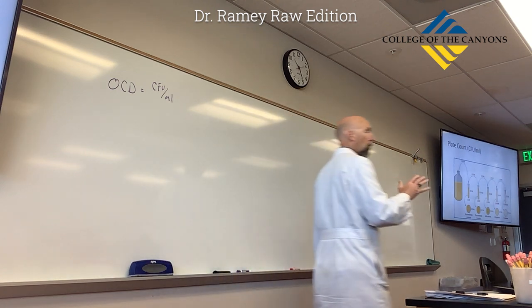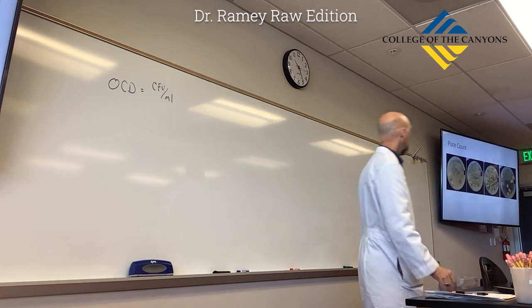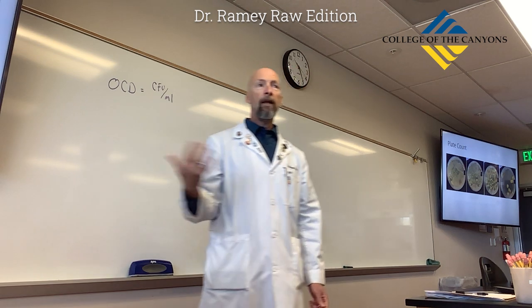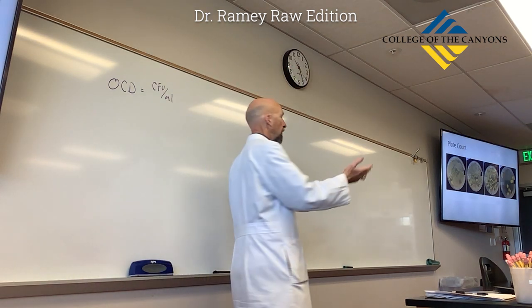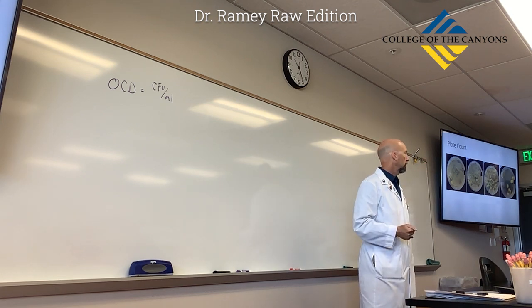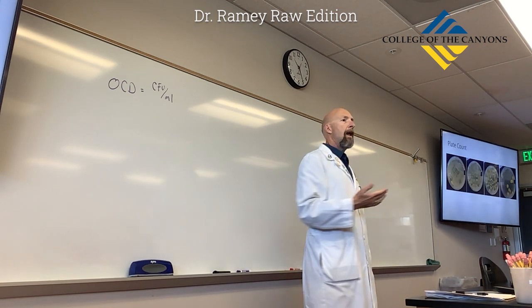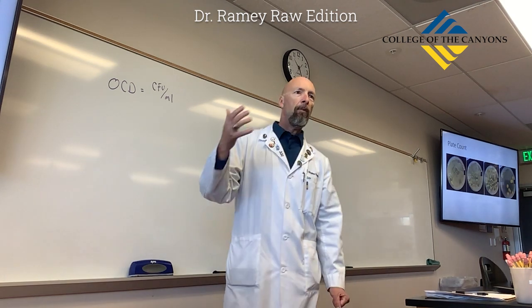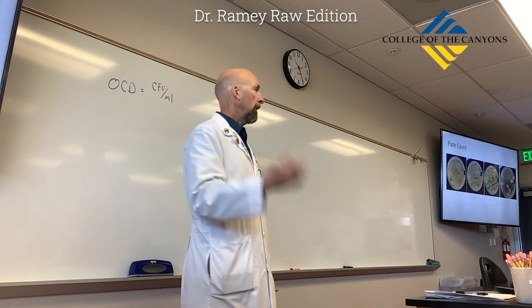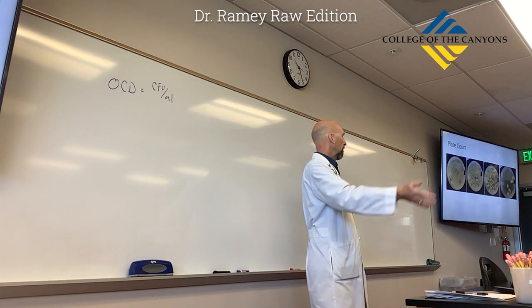And if you do that correctly, you're going to end up with 4 plates on Tuesday. You're going to inoculate 4 plates today. If you do it correctly, your plates are going to look something like this. You can see, from left to right, plates A, B, C, and D. Those are going to be your 4 plates. Does plate A have the highest or lowest concentration of bacteria? Highest, right? That's got the most bacteria. And then from left to right, the concentration goes down.